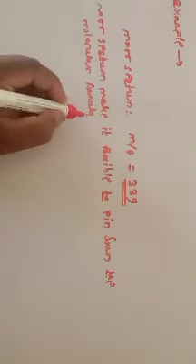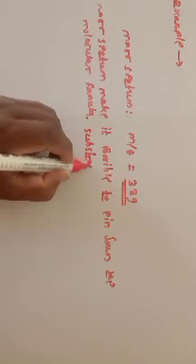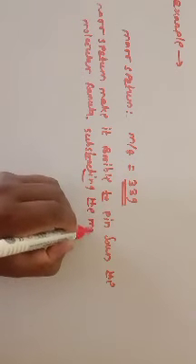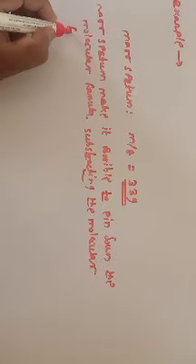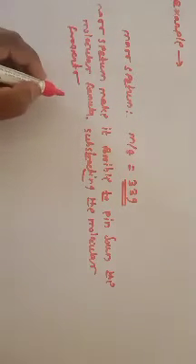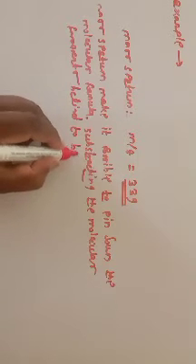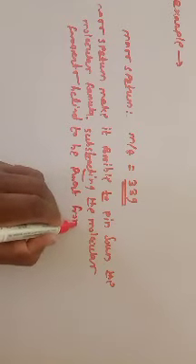So what we do is subtract the molecular fragments believed to be present from the total mass.